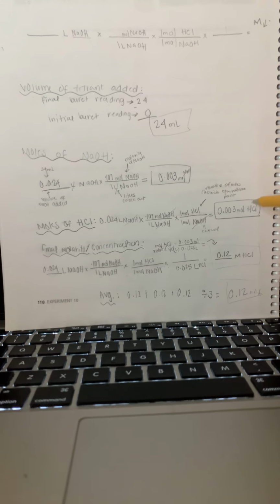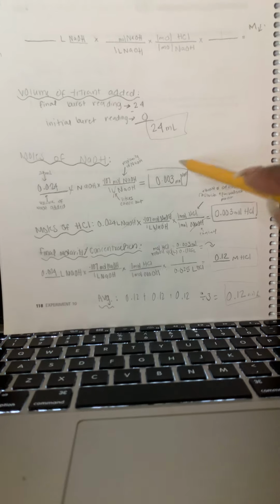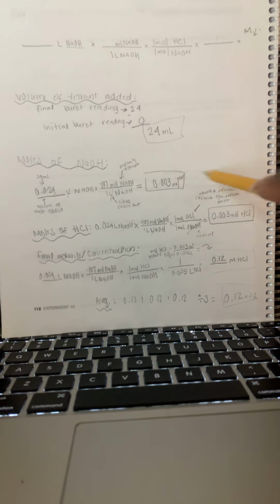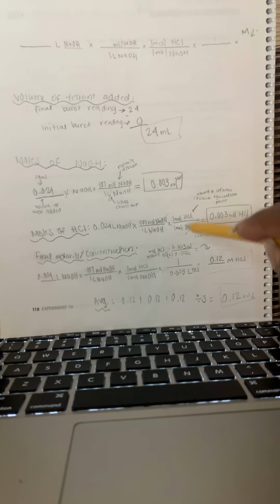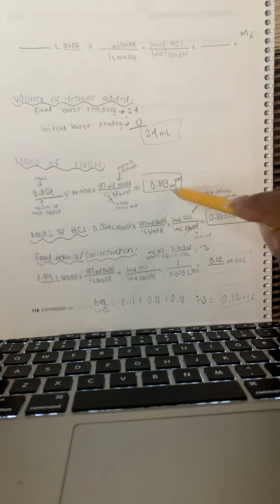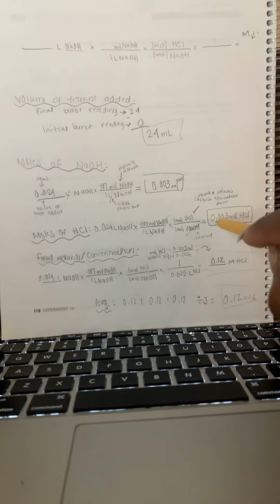And if you can tell, the moles of NaOH, which is the sodium hydroxide, and the moles of the hydrochloric acid should be the same. Just like how the 1-to-1 moles are the same, that means that these have to be the same as well. I just wrote out the equation to show you.